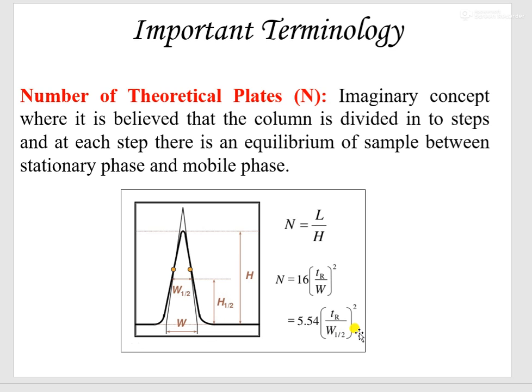the peak height. So we can see from this diagram, this is the width of the peak at base and this is the width of the peak at half of the peak height. So if we consider this is 100 centimeter, so we have to consider peak width at half height. So half height will be 50 centimeter, and at 50 centimeter you have to consider the value, and that can be taken as a W half.